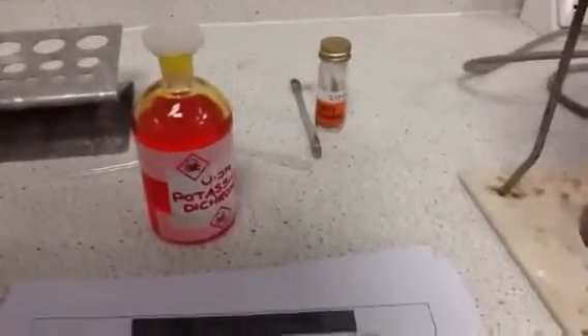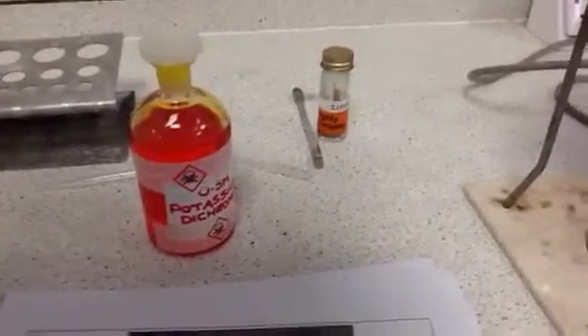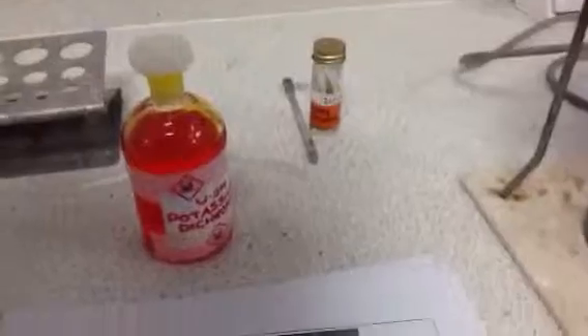In this experiment, we are making chromium 2 from chromium 6. We've got potassium dichromate, with chromium in the 6 plus oxidation state. We're reacting it with zinc and hydrochloric acid, because that will produce hydrogen gas, which is our other reagent.